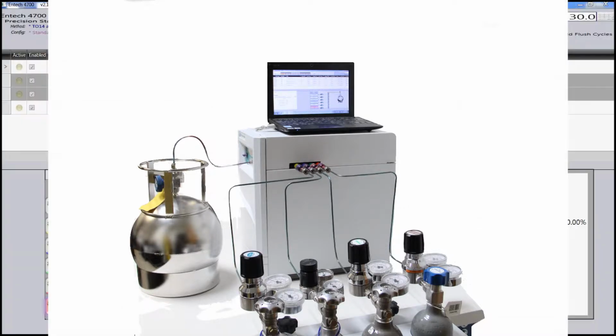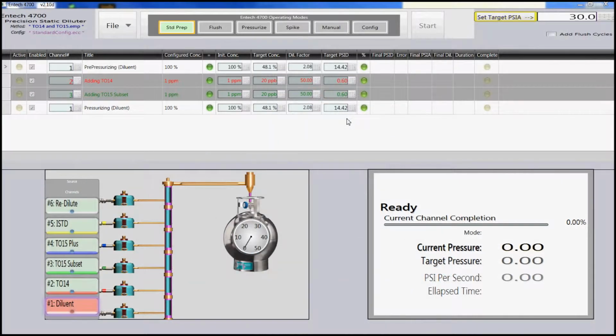My name is Harry Every and I'm a Senior Development Engineer here at Entech, and it's my privilege to show you today how to create a new standard preparation method.